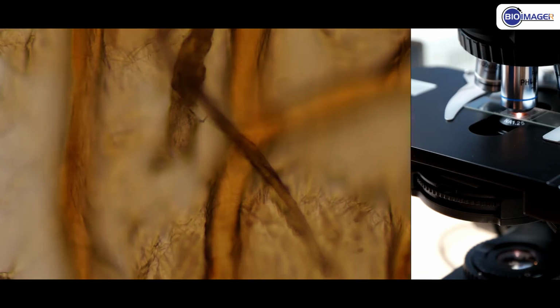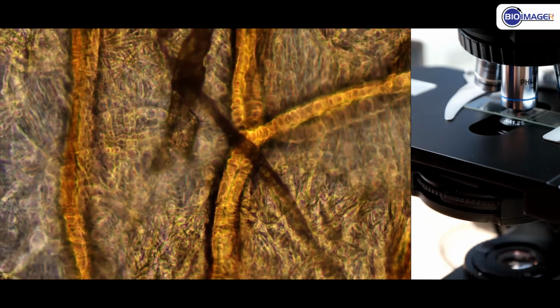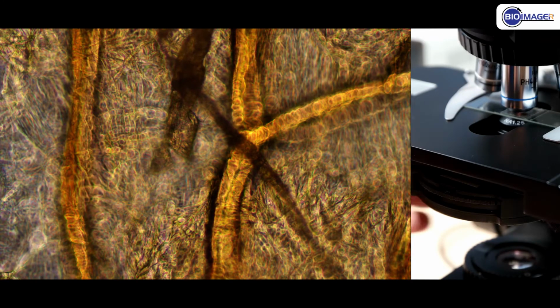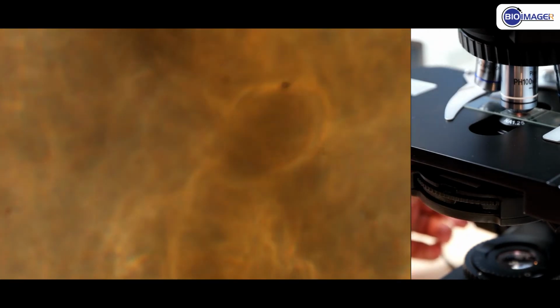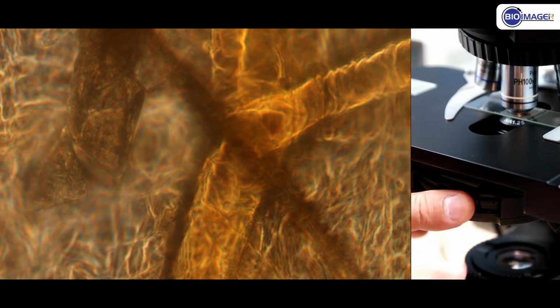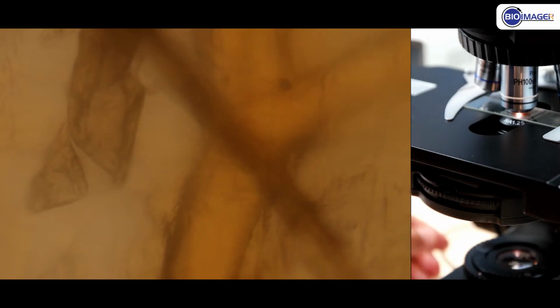You see it first at bright field mode, and I'm going to use the 40x from the condenser, and we may need to retune the focus just slightly, and depending on which part of the sample we are interested in, we can adjust the focus. Next is using 100x, but obviously this will not be in good quality because the objective lens is oil immersion, and this will be the phase contrast. And I switch to bright field to give you an idea of what happened using this objective lens.